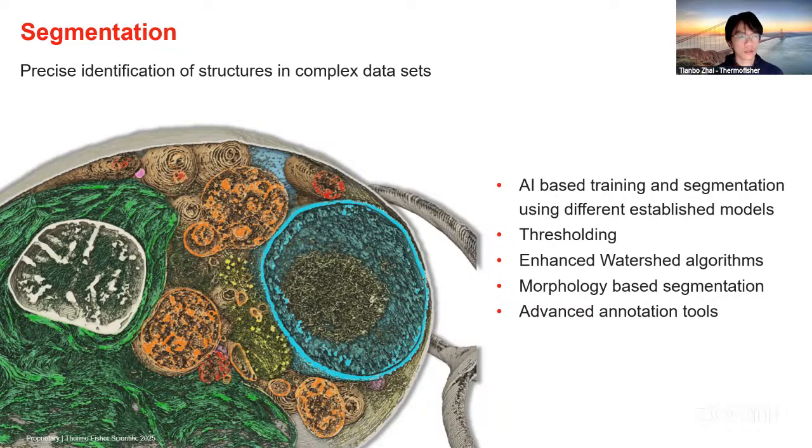If you can set a good criteria, or if you can use a good tool or suitable tools to achieve this classification goal, then you would be heading towards a better segmentation result. Because then you can later focus on only the region of interest to extract the statistics out of it.